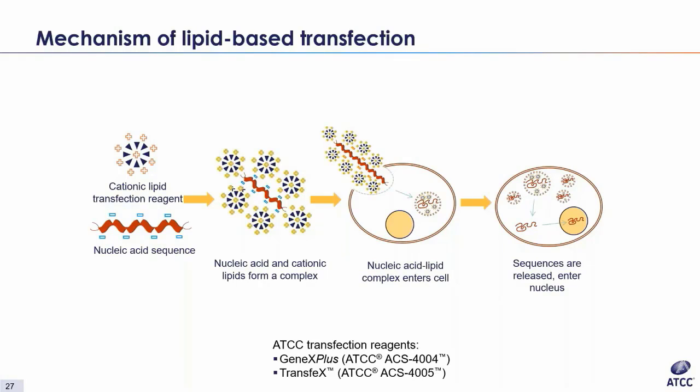So now I'm going to discuss the basic method of lipid-based transfection. Transfection is a method for introducing exogenous nucleic acid sequences into cells. There are various ways to accomplish this. One of the most common is lipid-mediated transfection. Lipid-mediated transfection is the most accessible and usually the simplest method available.